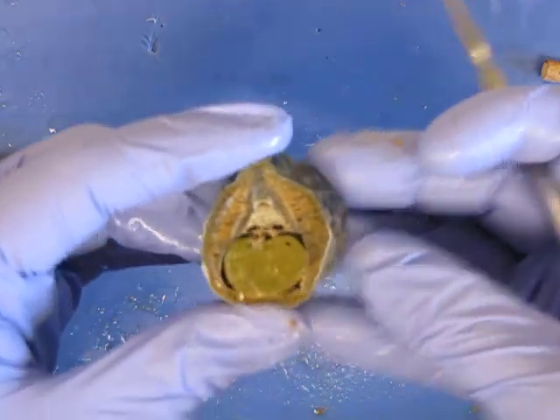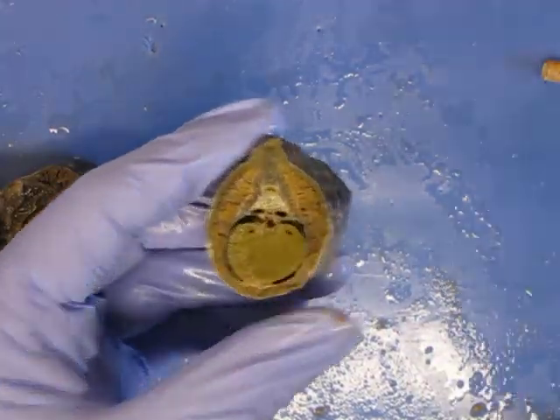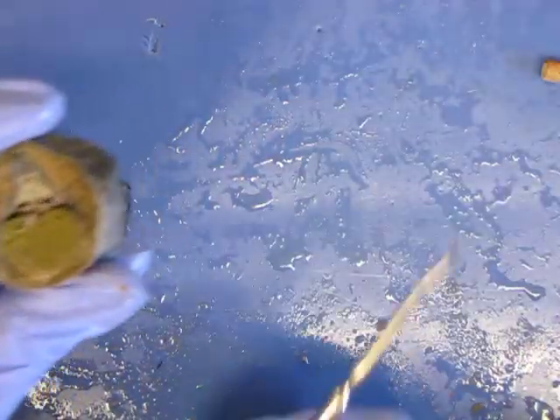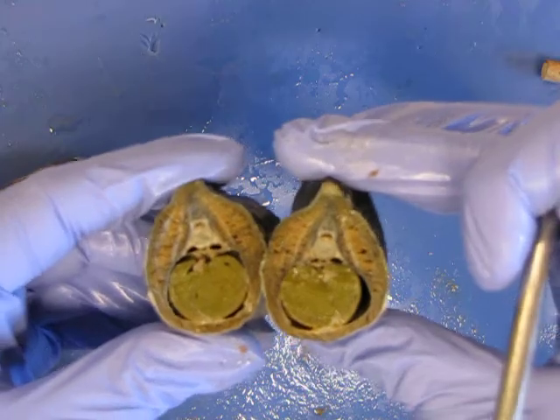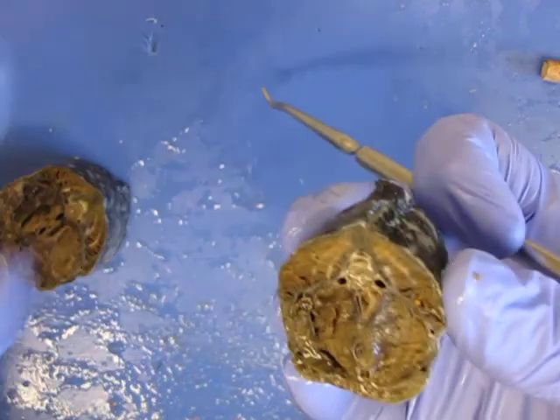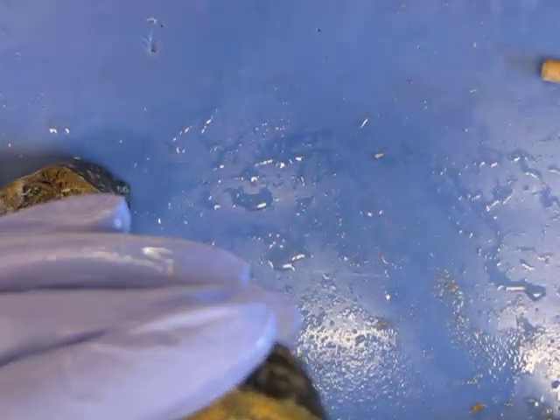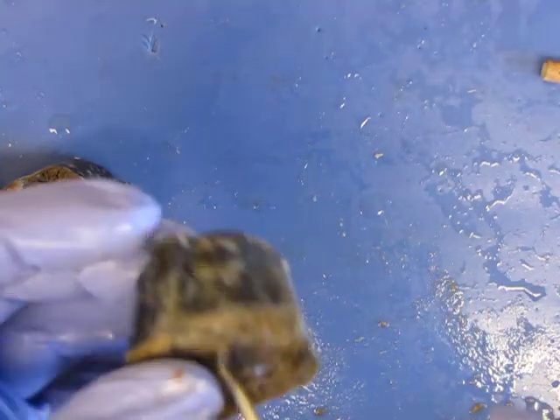Now, turn it over here, and suddenly, whoa, we have a giant organ there. It's green color, liver. Liver here is much larger. Like I mentioned on the sagittal section, in the male it's much larger than it is in the female because it has that reproductive capability, or the reproductive help there where it produces pheromones, I believe. So here's the intestine.